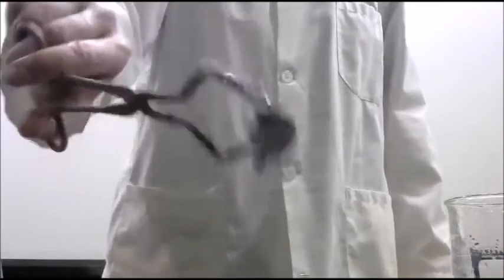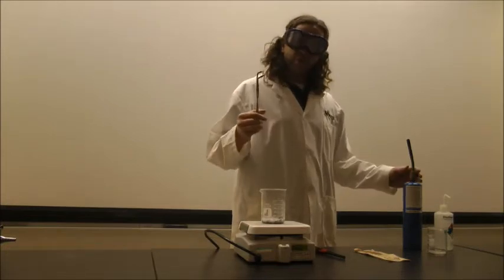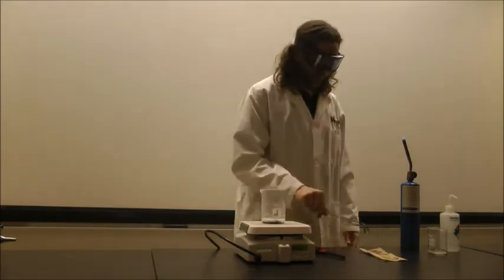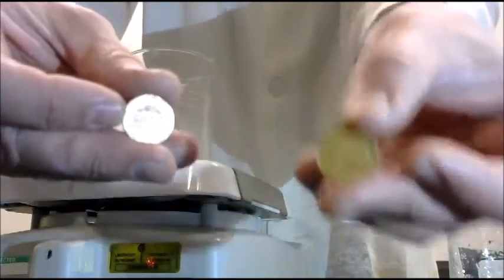And moments later, he would be able to draw out, instead of a copper penny, a silver penny. But silver wasn't good enough for the alchemist. They would use the element of fire to turn it into gold. Rather than that base copper penny, now what they see is a golden penny.